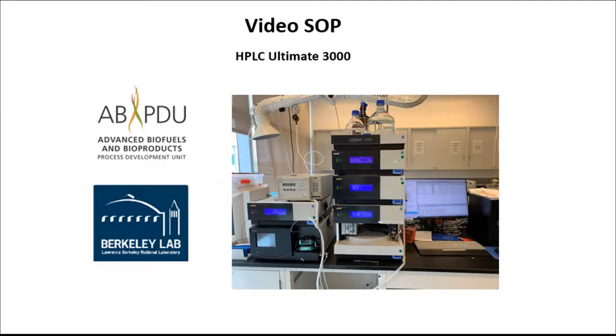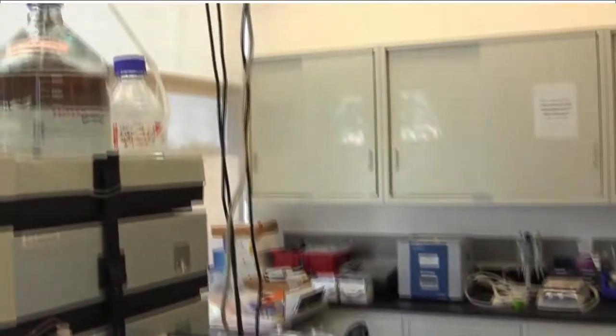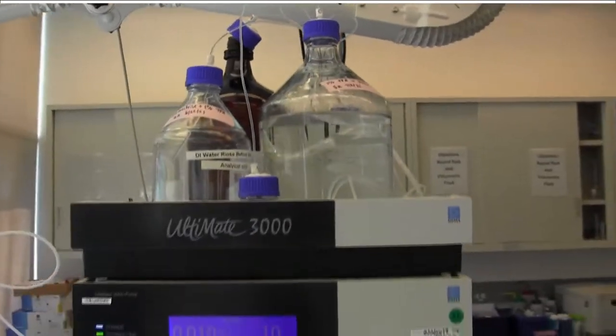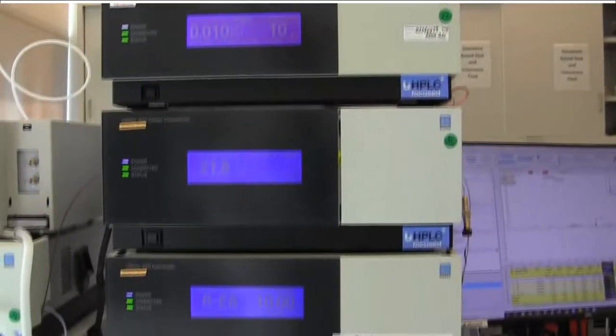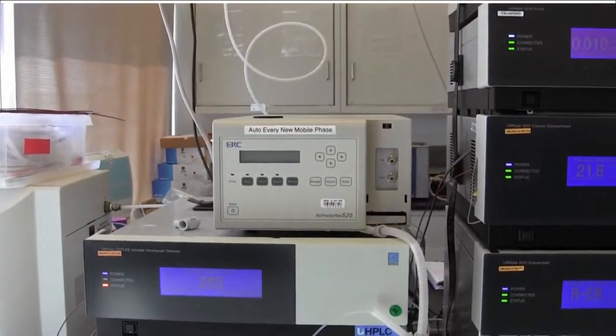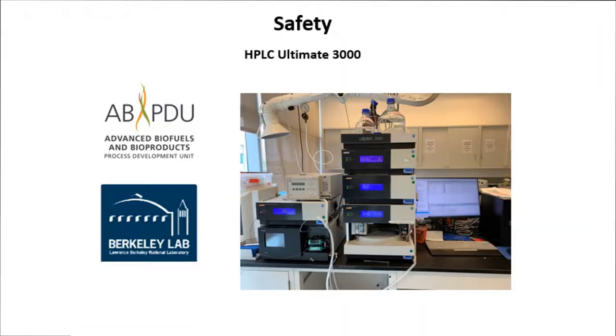Welcome to the ABPDU's Video SOP for the UHPLC Ultimate 3000. Today we will describe the standard operating procedures related to our HPLC system. HPLC, or High Performance Liquid Chromatography, is an analytical technique used to separate and identify compounds found in any sample.